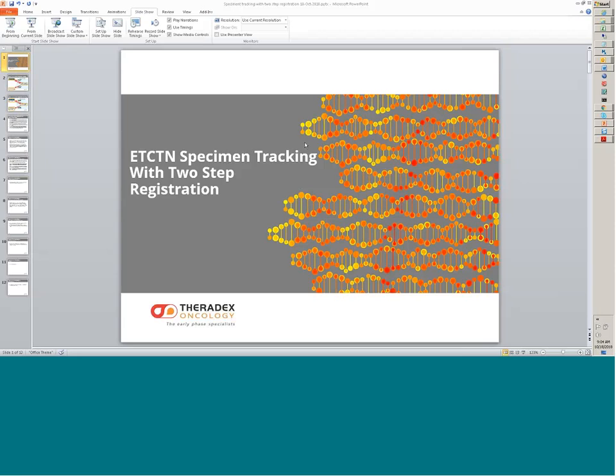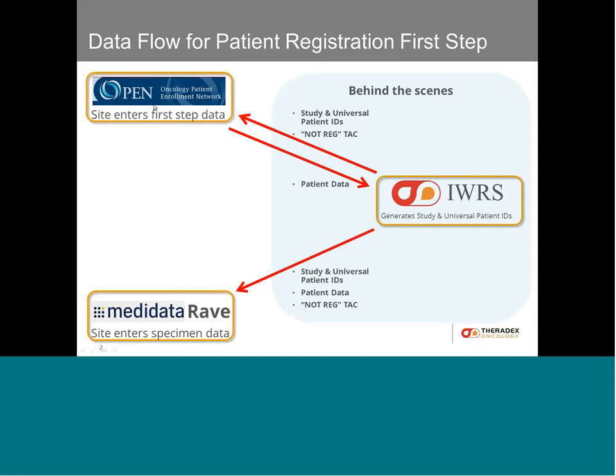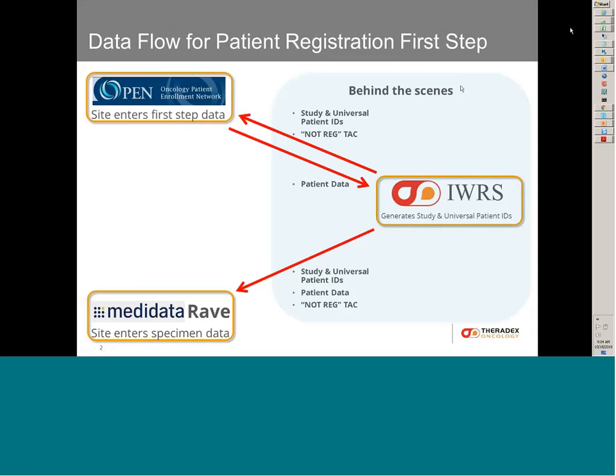I'm going to begin this morning showing a few slides of the process, and then we'll get right into the environment to see exactly how the data entry is done. So first of all, we will be utilizing the open registration system for entering patient data. And this is a standard for all ETCTN protocols.